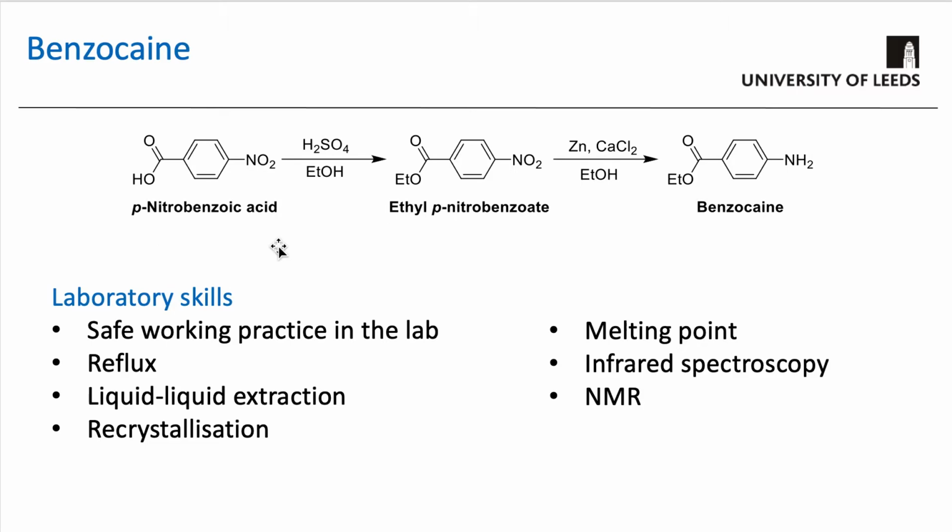The other reason for this experiment is to give you practice of performing laboratory skills: working in the lab, performing heating reactions under reflux, performing a liquid-liquid extraction, and recrystallization. Both the products are solid, so you'll purify them by recrystallization, and then analyse them using melting point, IR, and NMR.